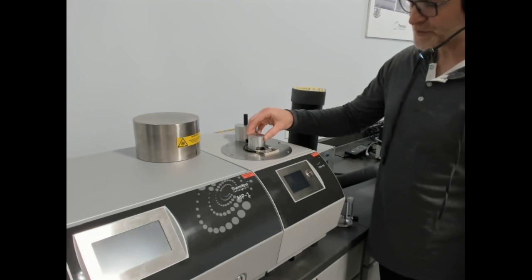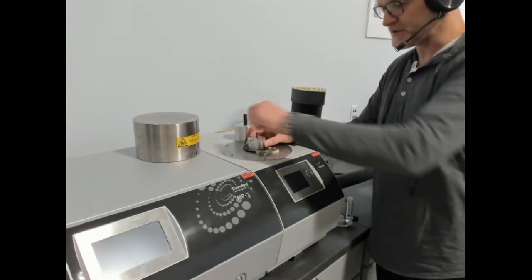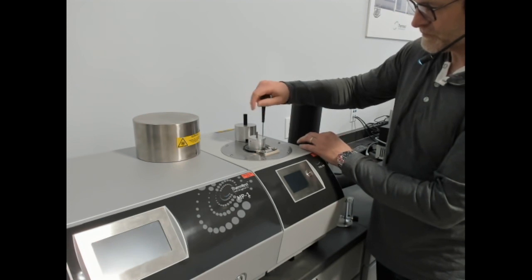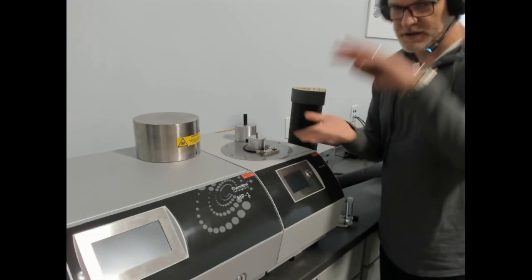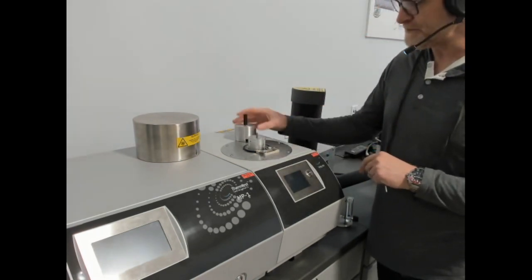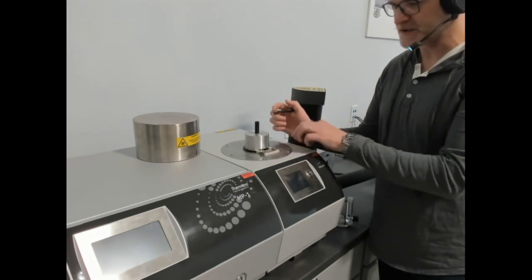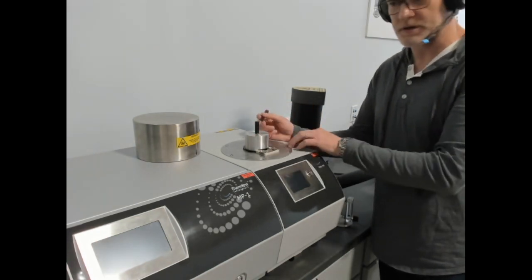This top piece closes the heating side of the sample cell. So we secure the sides. That creates a clamping pressure between the two sample pieces. This is where the heating comes from. This closes the cold side. So inside there you have heating and cooling opposing each other. This cold side goes to the lowest temperature, so in this case, this cold side would go to -160.